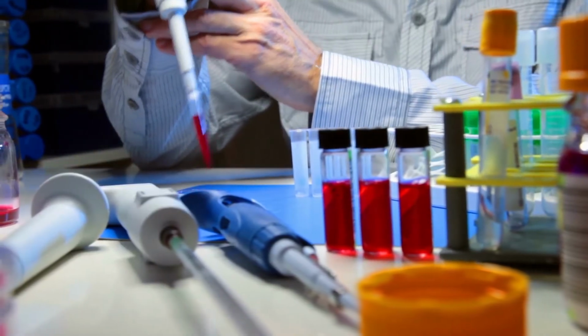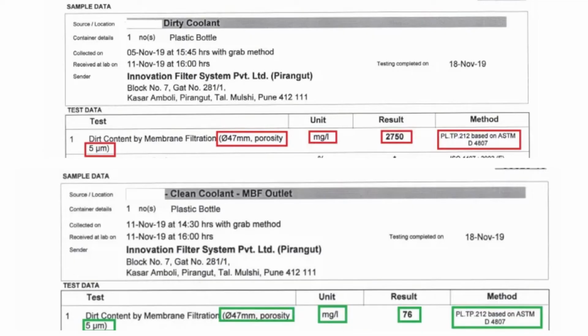Likewise, in the pharma industry, because of various rules and regulations and safety concerns, the manufacturers need to be aware of cross-contamination risks, and hence the machines that they use and the output that they give need to be very clean and up to the standard that the regulations have set. And that is where they use this Millipore testing, in understanding whether the parts or whatever is touching their finished product are clean up to the standard.